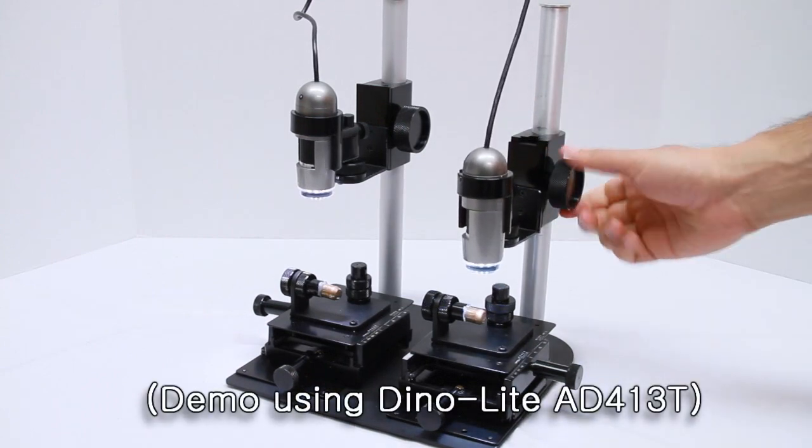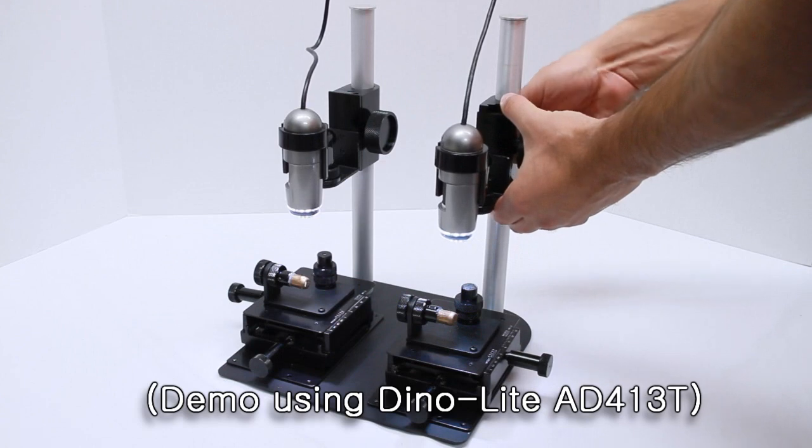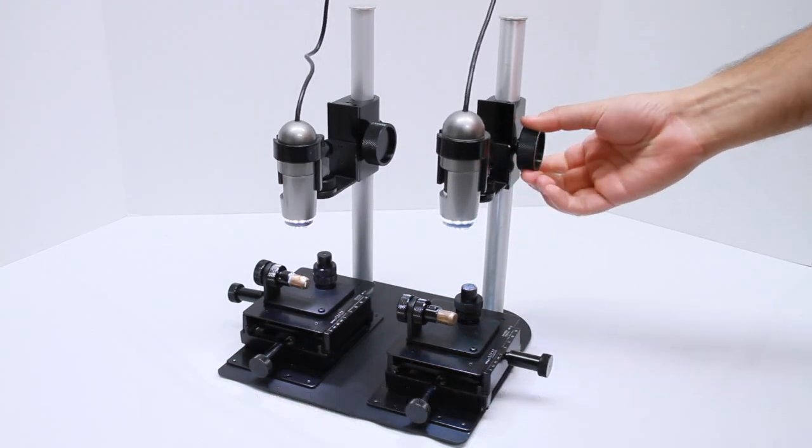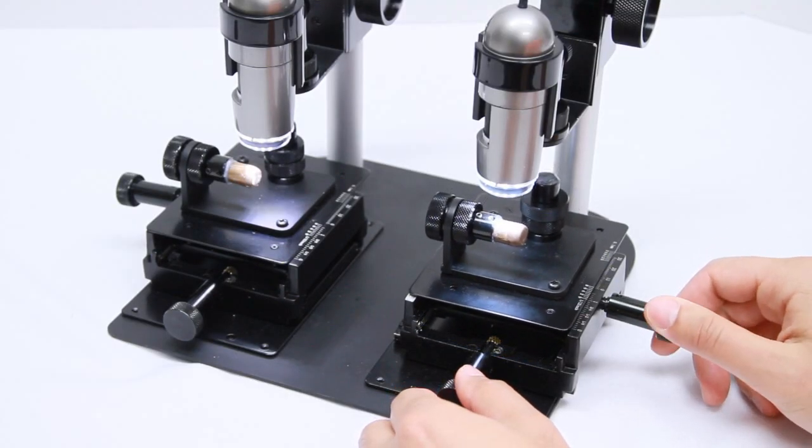The MS45BX-D2 allows for travel up and down and fine adjustment with the dial on each block. Each base also has fine adjustment knobs for X and Y movement.